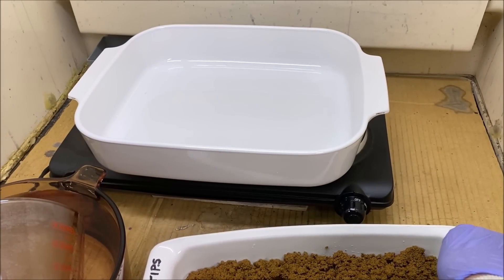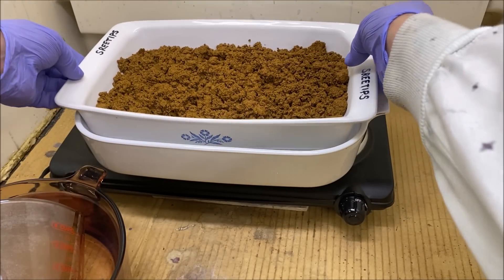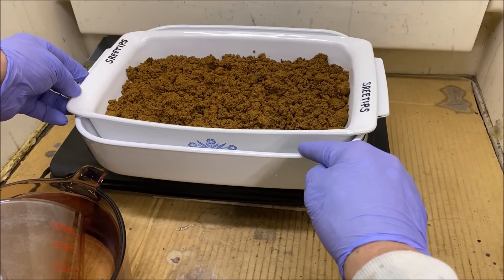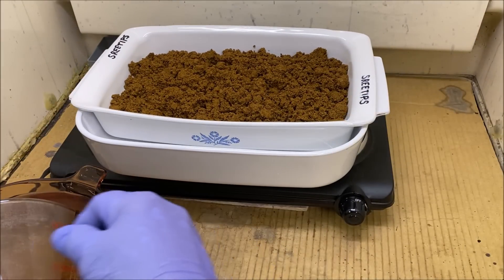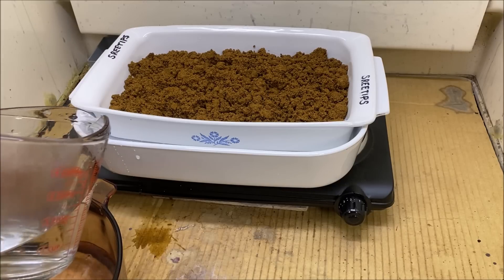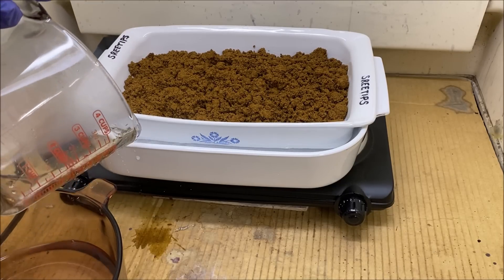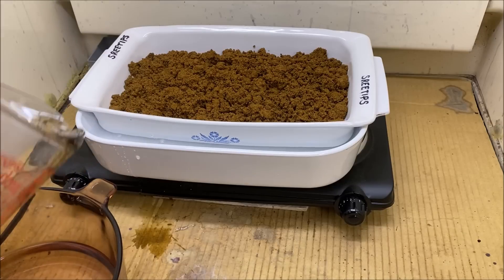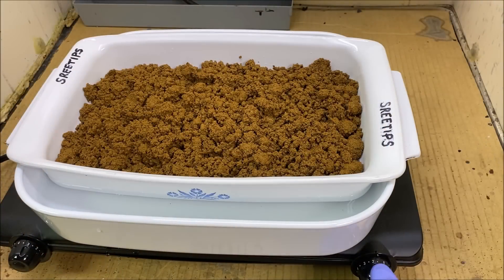Let's put our pan up inside this other pan — it fits in there nicely and gets held up off the bottom so we don't have direct contact. We're going to dry the gold off slowly with a water bath. We'll put this on time lapse and let it dry out real slow.